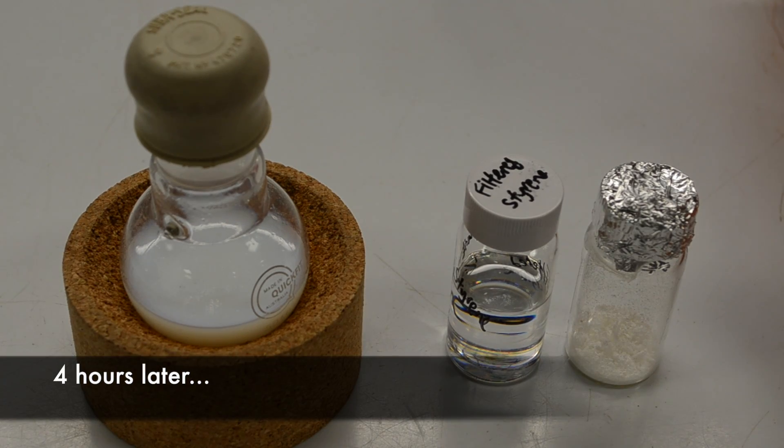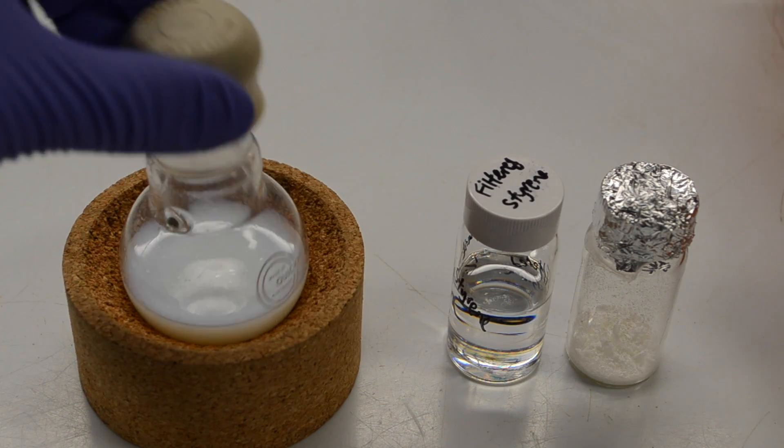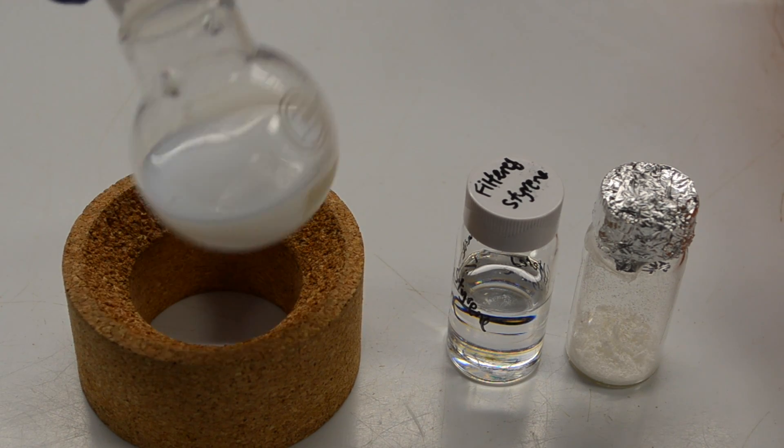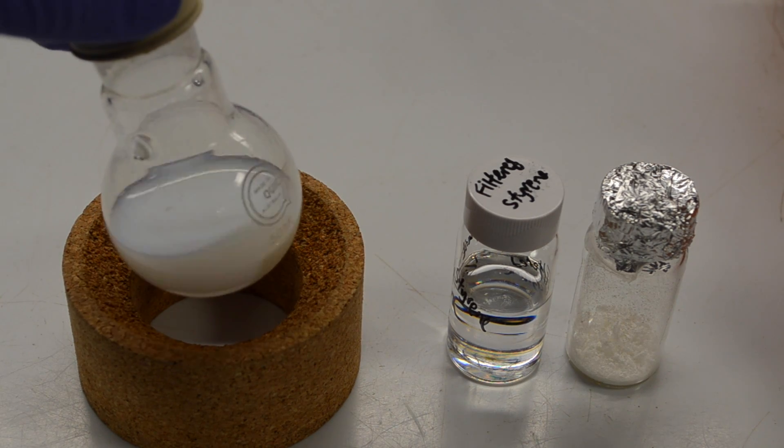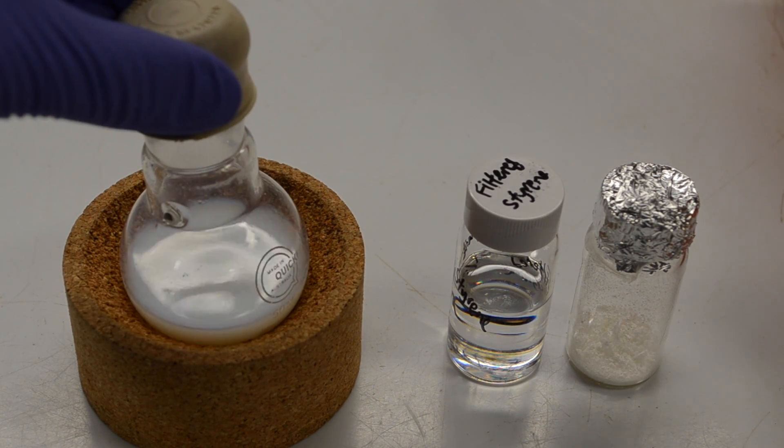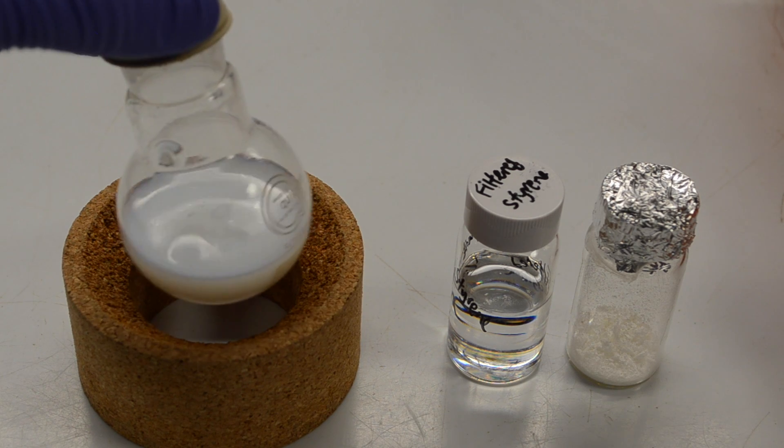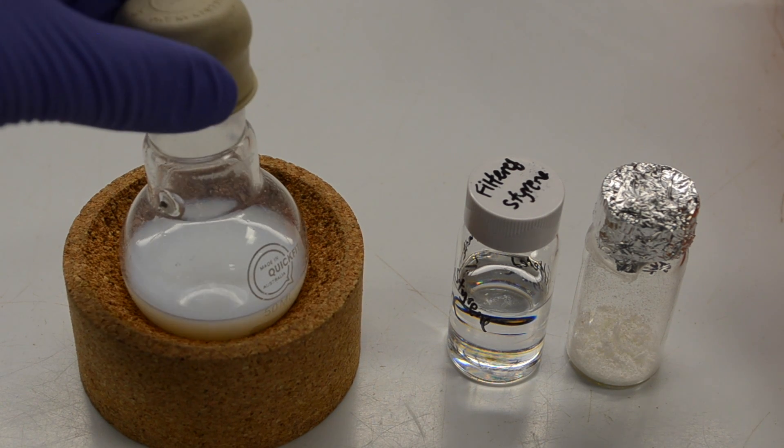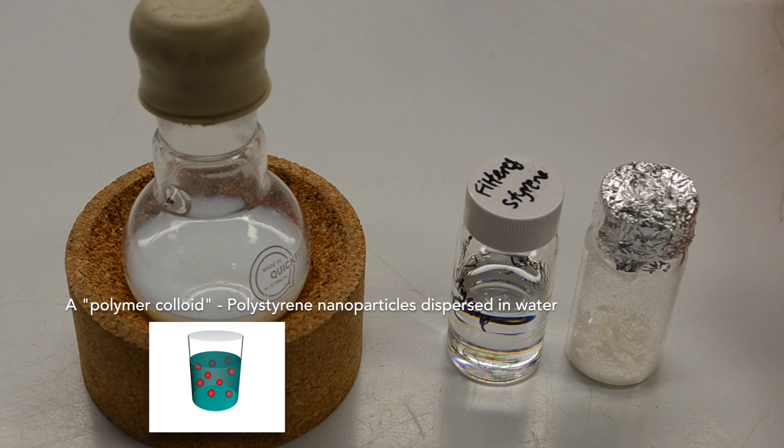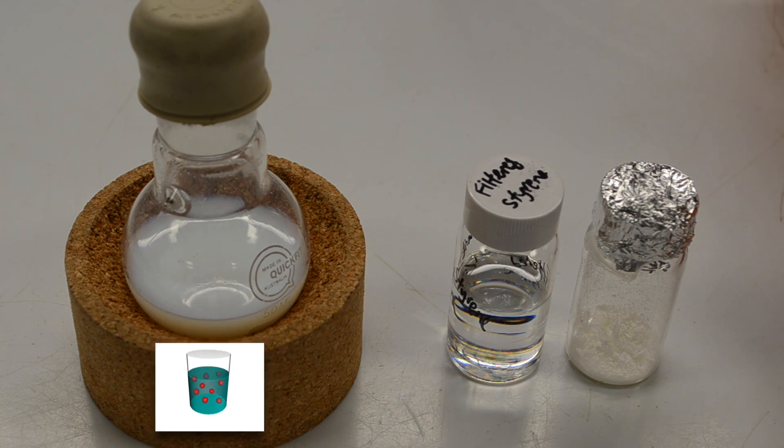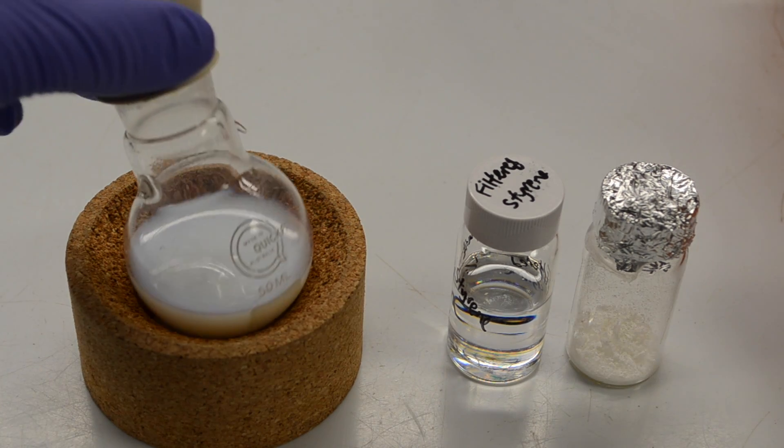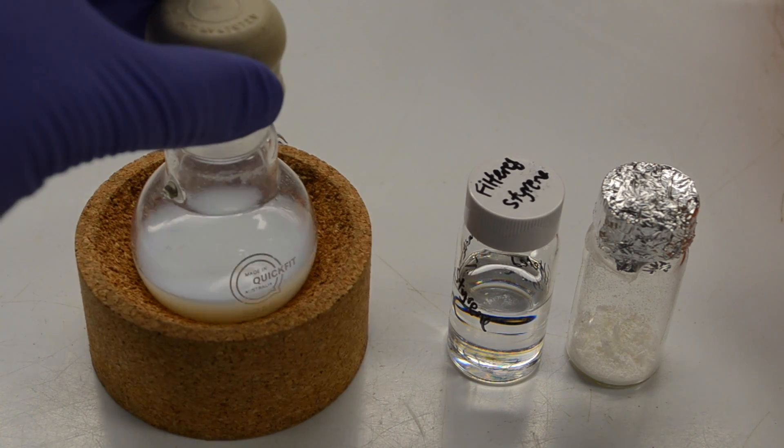So we've reached the end of our emulsion polymerization reaction now. And what you can see is that our final product kind of looks like milk. It's a very easy to flow white liquid that has the viscosity of water. And what we've made is a dispersion of polymer nanoparticles, polystyrene dispersed in that water, stabilized by our surfactant, our soap.